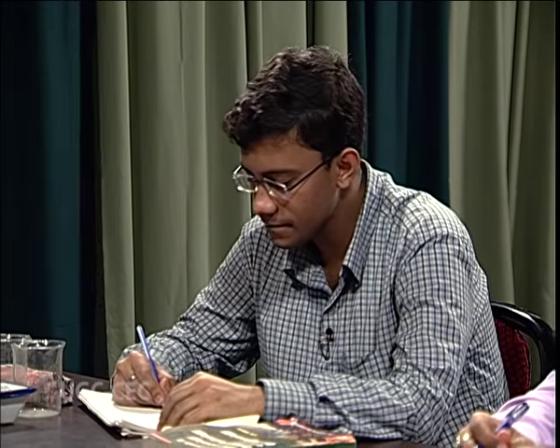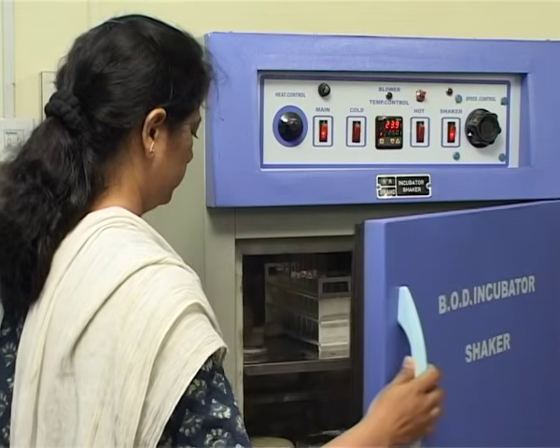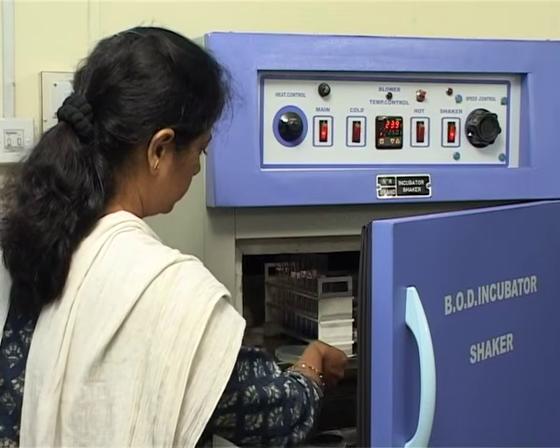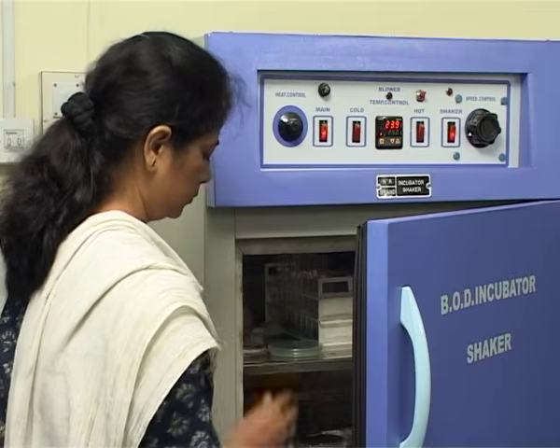Now, facultative aerobes or facultative anaerobes can grow on the surface. But if we talk about the anaerobes, they will not grow by the spread plate technique. So, this is basically the disadvantage of the spread plate technique. Now, after you have spread the culture, we just invert the Petri plates and put them inside the incubator at 37 degrees Celsius overnight, say for 18 to 20 hours.